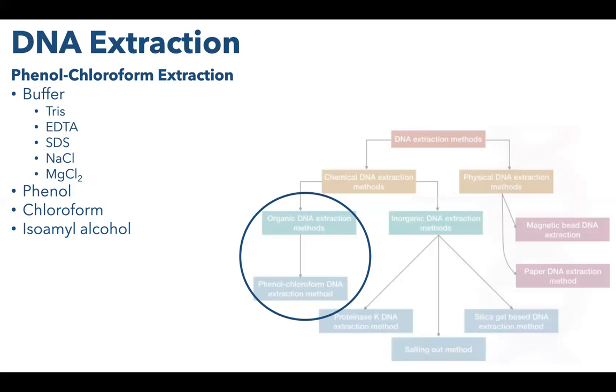Magnesium chloride provides magnesium ions that help in stabilizing the structure of your DNA by binding to the phosphates in the phosphate sugar backbone. Remember, the phosphates are negatively charged in physiological pH, so the magnesium ions help to stabilize the negative charge of your phosphate sugar backbone.